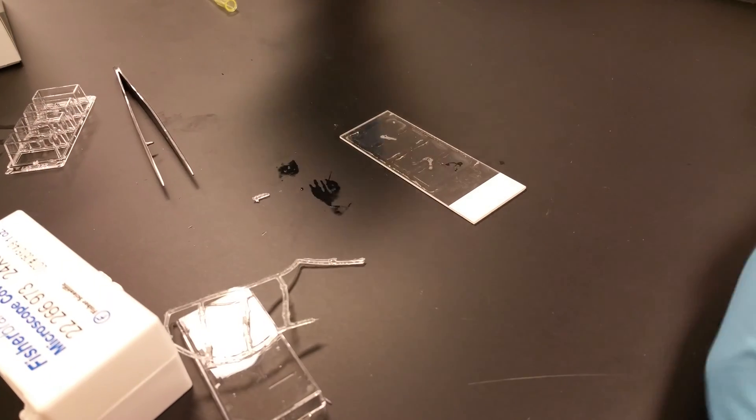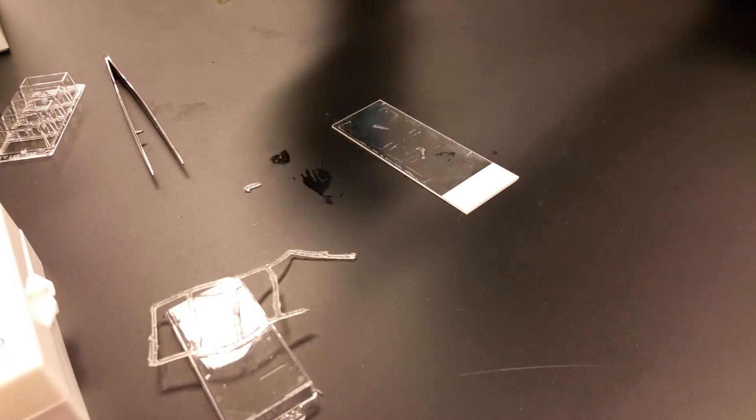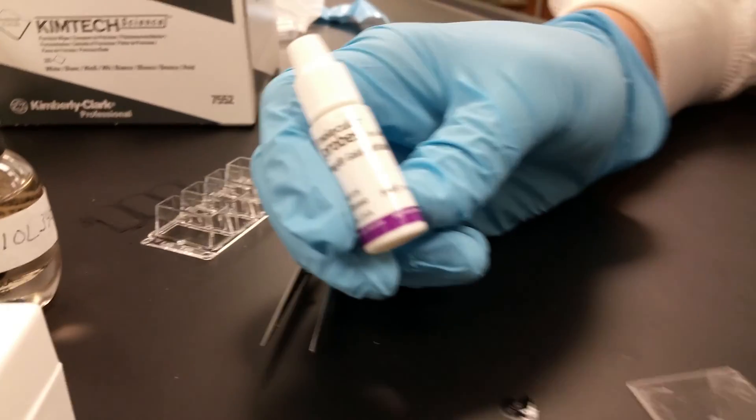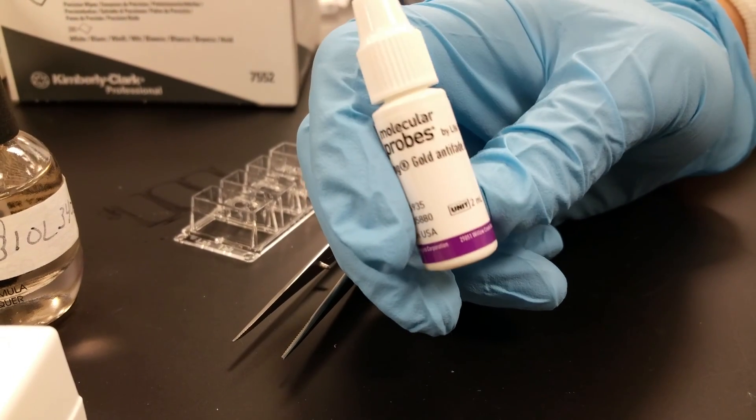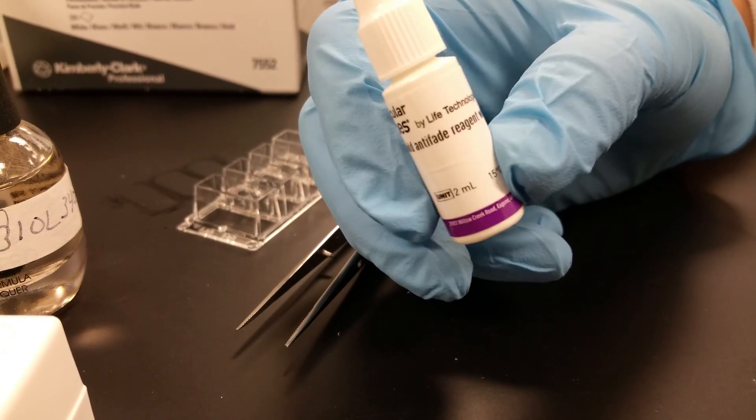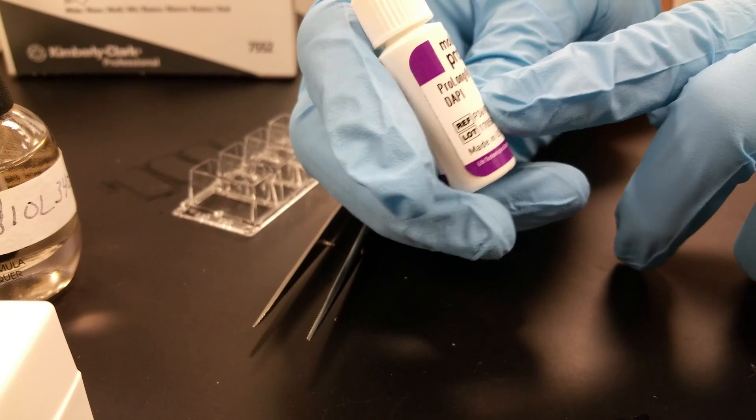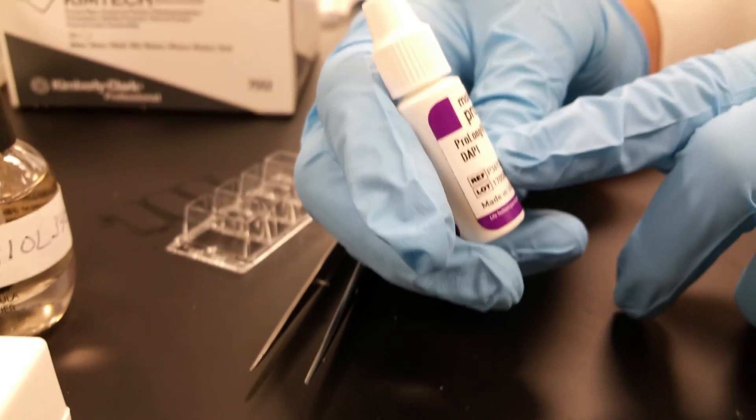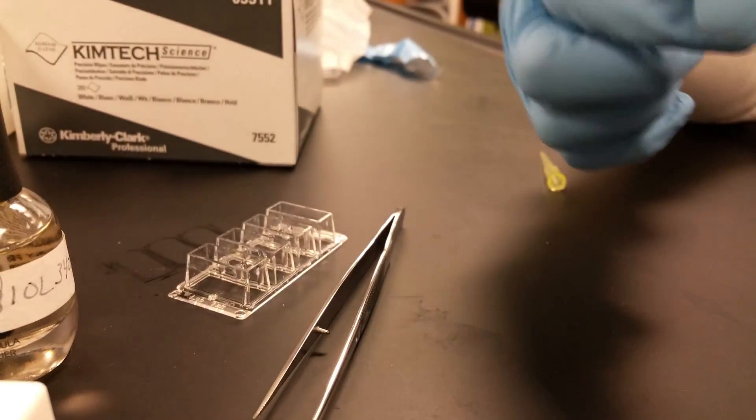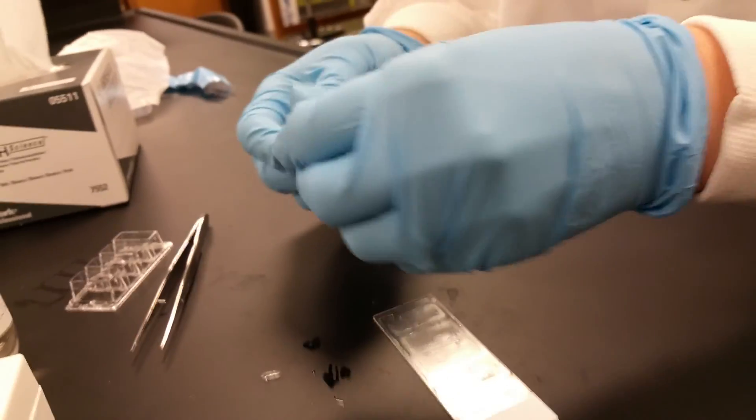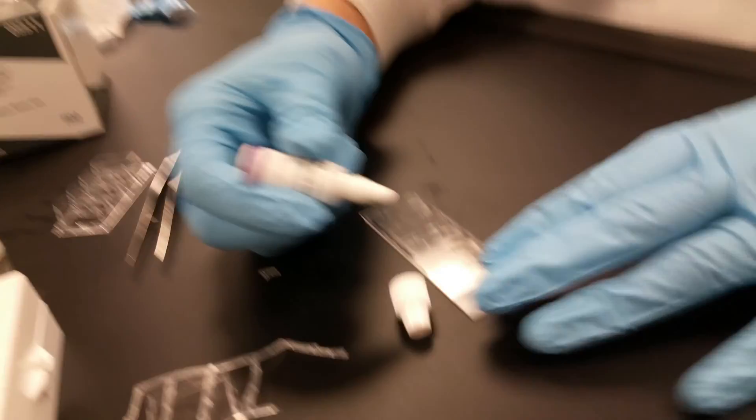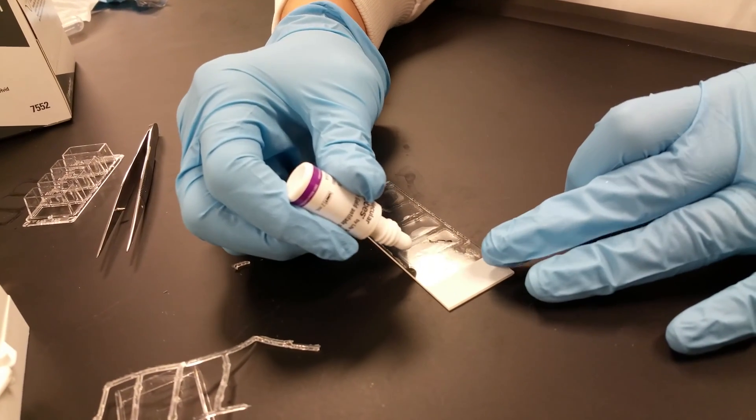Now we're going to add our mounting medium. This has a reagent in it that's going to keep your fluorophores from quenching as easily, and it also has our last stain, DAPI, which is blue and it's going to bind to the minor groove of DNA. This is going to help us see the chromosomes. This comes out as a dropper, so you want to do one drop per well.